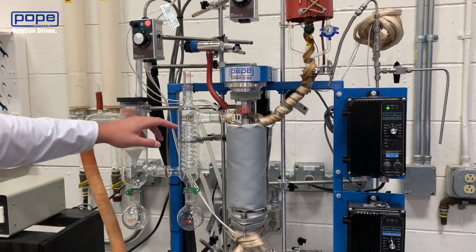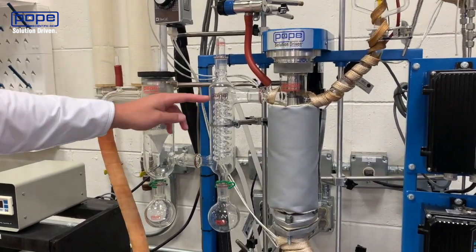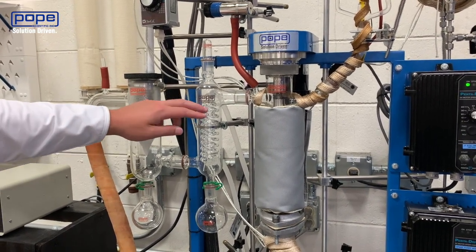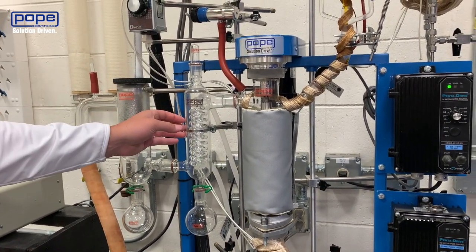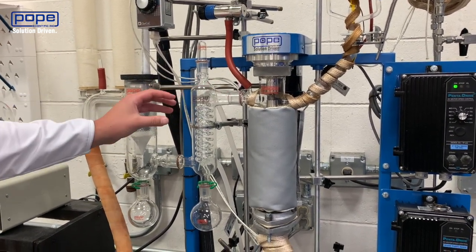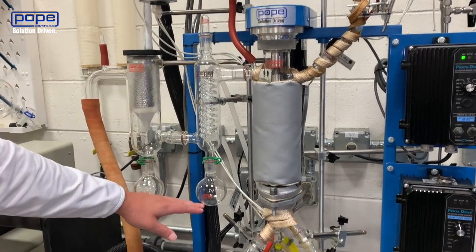So while that's going on, over here is your external condenser. Right now I have the external condenser set to negative 15 degrees Celsius. That gives a nice cool surface for whatever light terpenes as well as potential residual solvent gets blown over and then will collect down in this flask here.